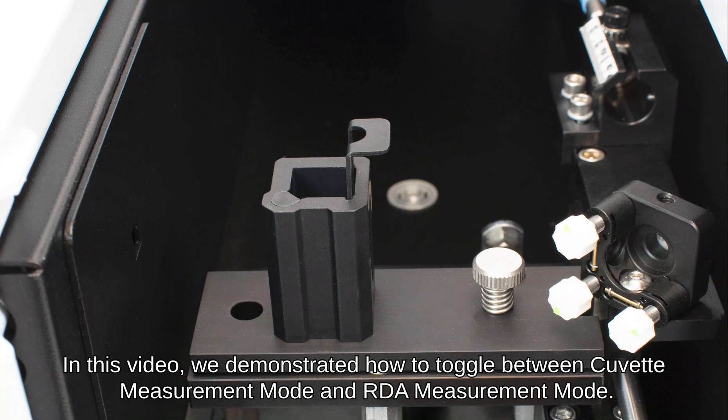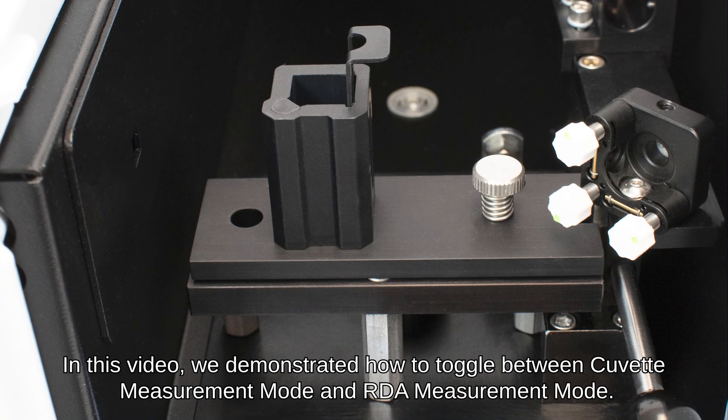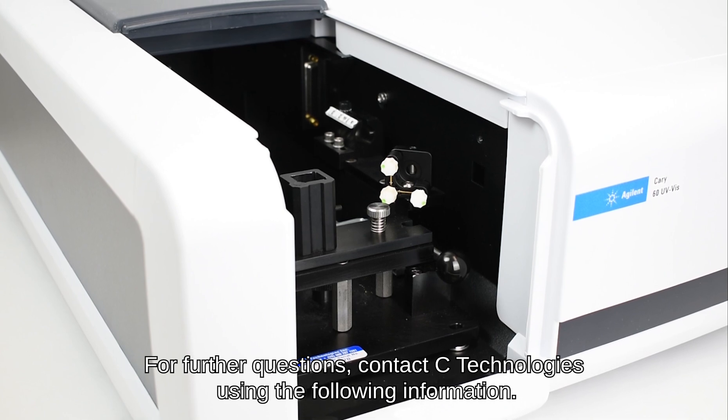In this video, we demonstrated how to toggle between cuvette measurement mode and RDA measurement mode. For further questions, contact C Technologies using the following information.